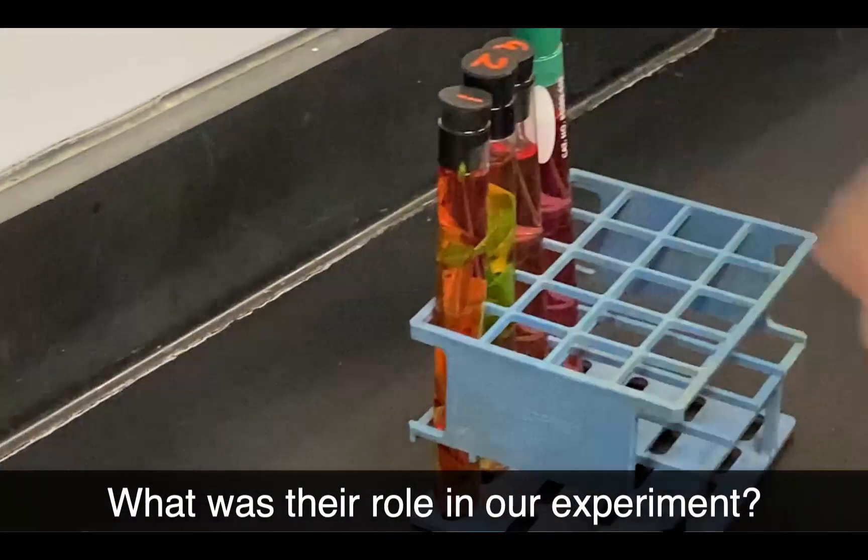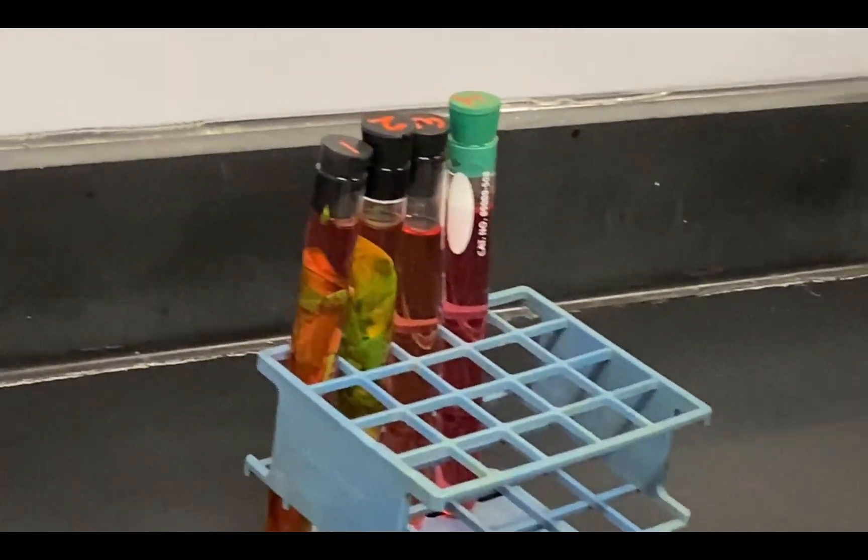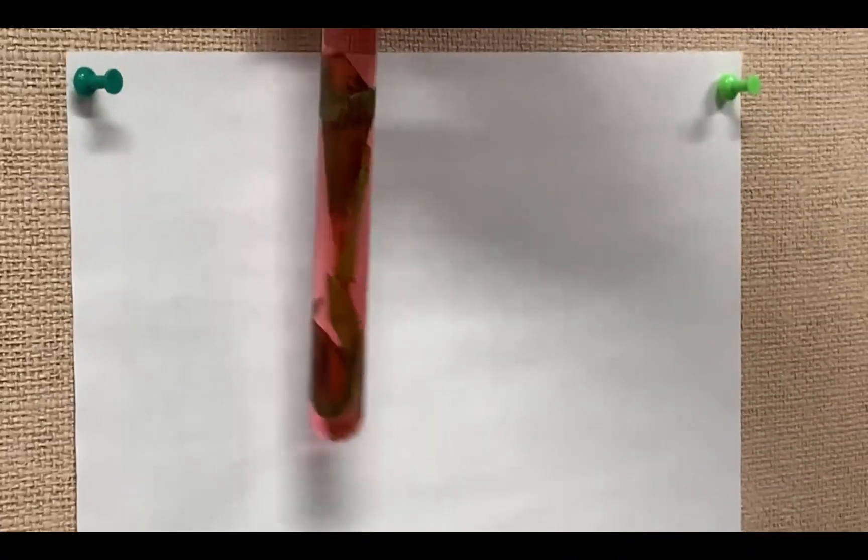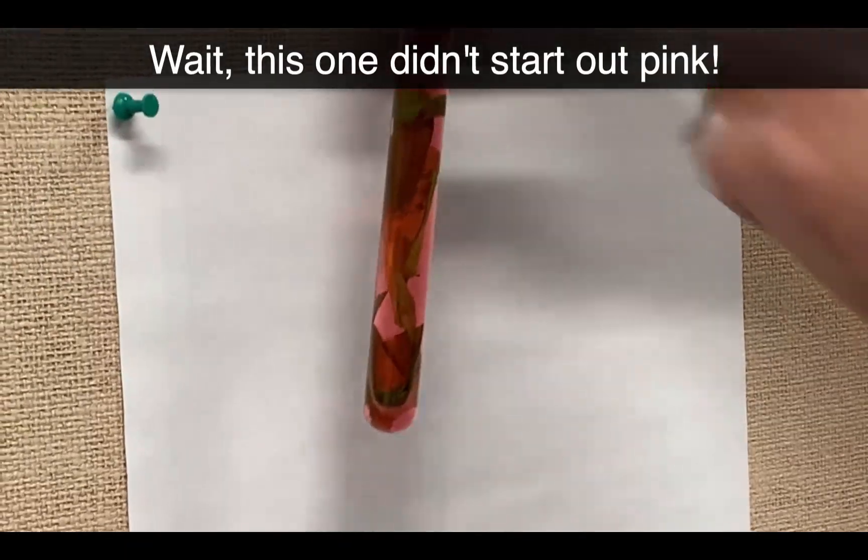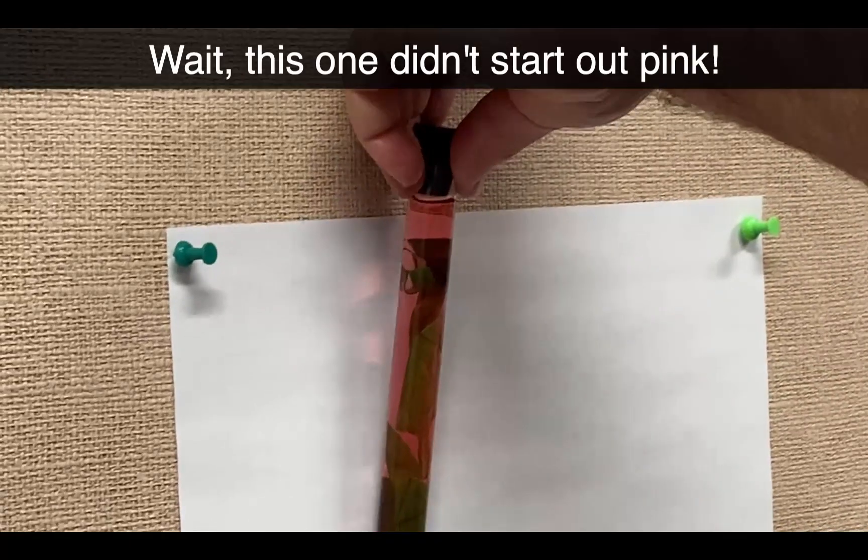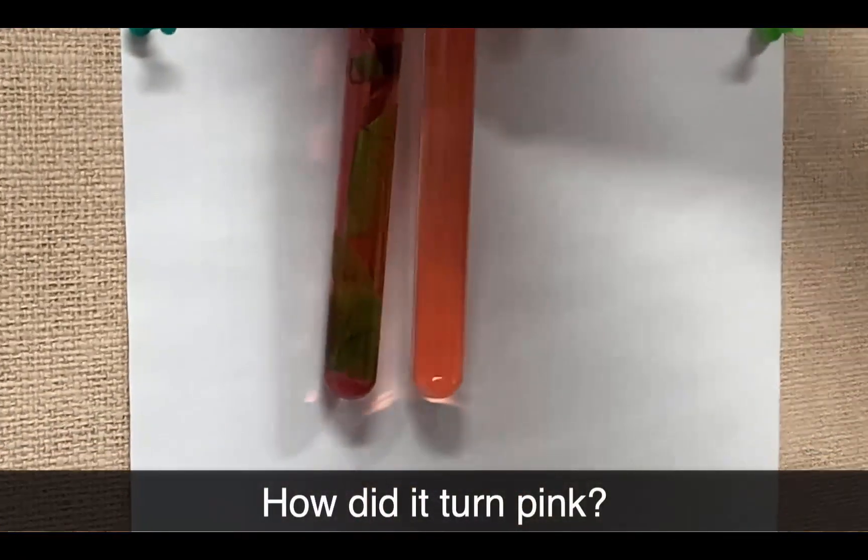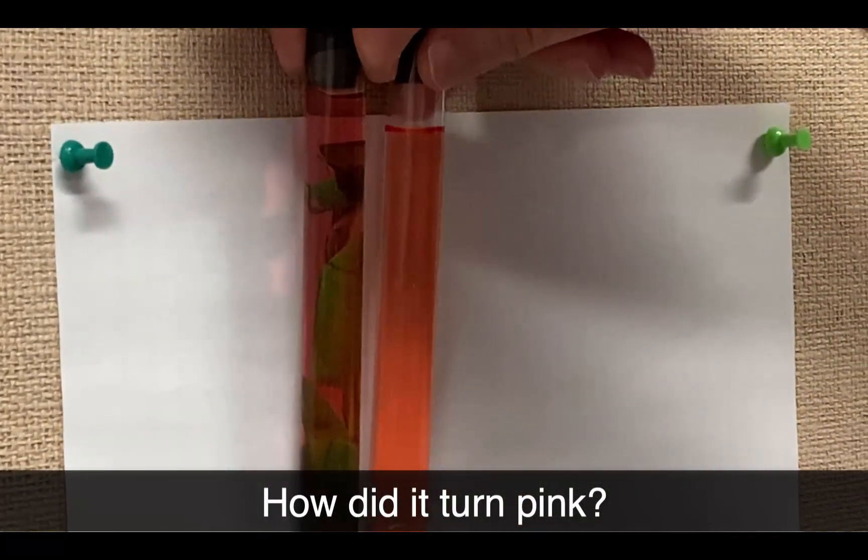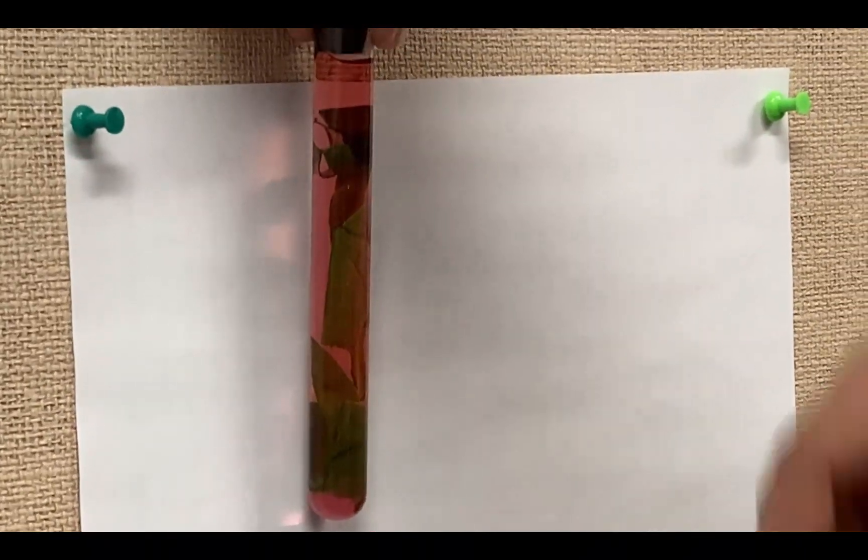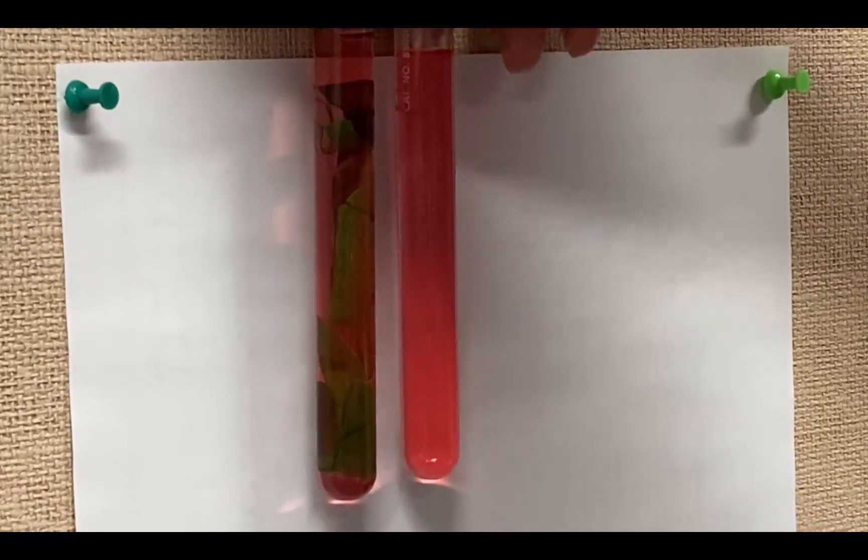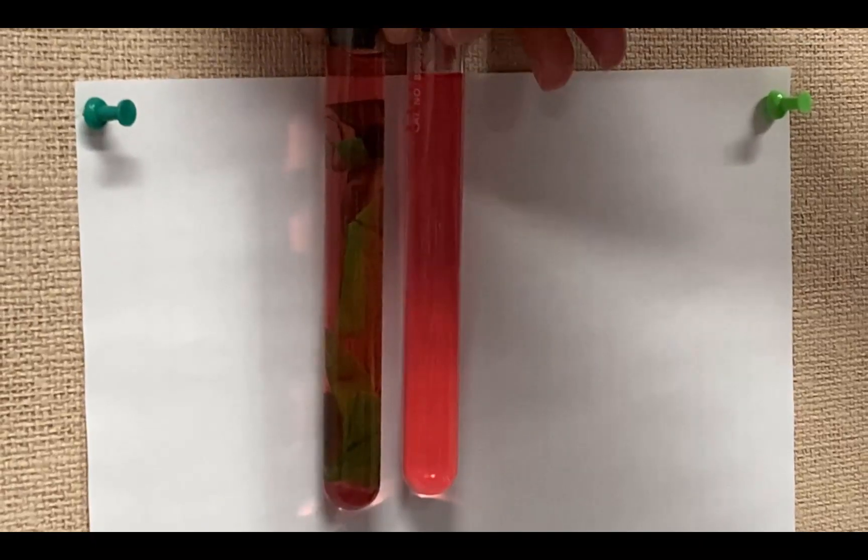Now let's take a look at tube number one. It looks nice and pink. How do I know for sure? I can compare it to tube number three and see that tube number one is definitely more pink. Comparing it to tube number four which started out pink, we can see they have about the same coloration.